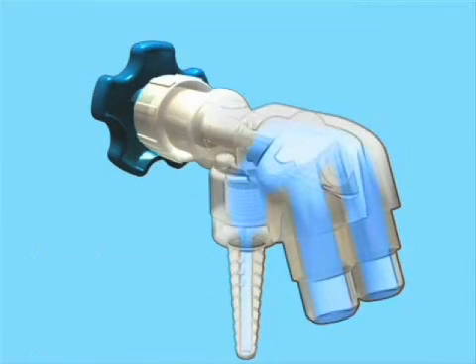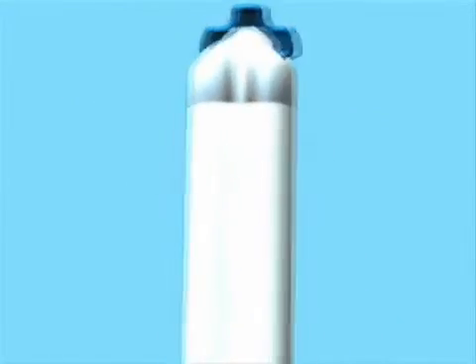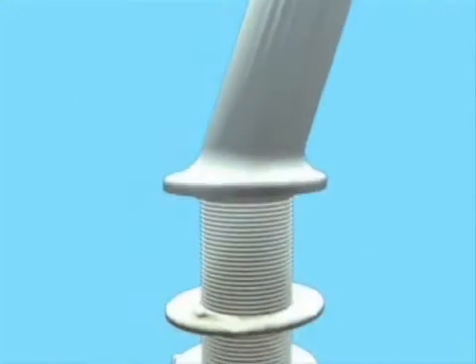Separate supply and return lines within the faucet body ensure high flow with minimal loss of pressure, supplying pure water to the outlet valve with virtually no dead legs. These tubes are heat flared and secured to the faucet head for high-purity sealing with minimal crevices.